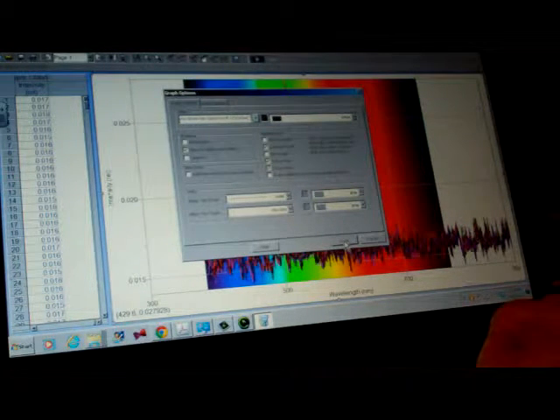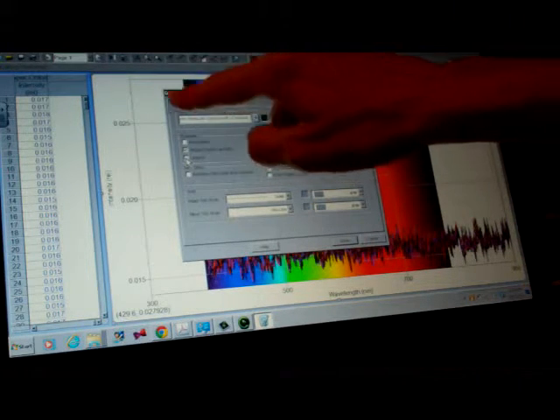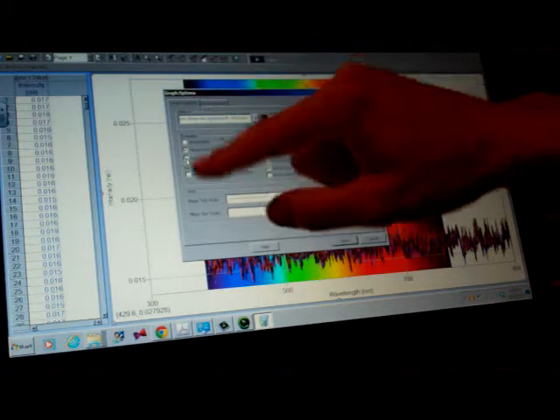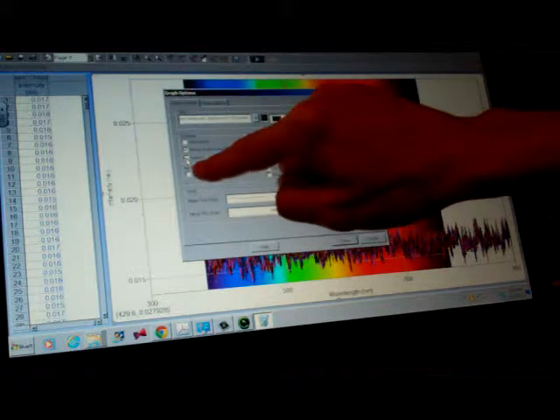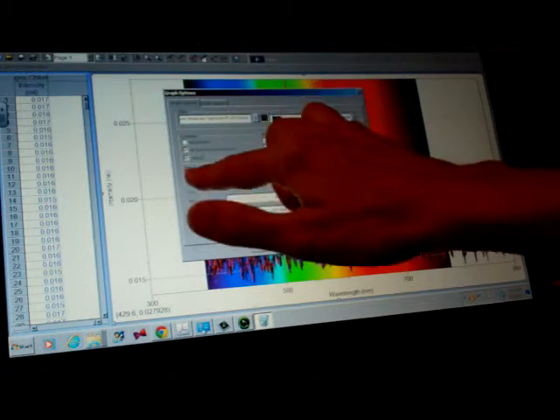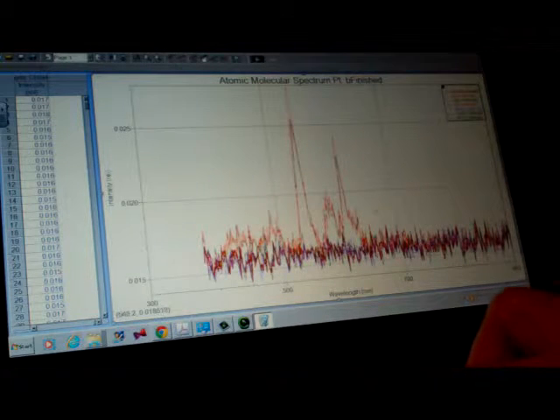And again, what else I would like you to do is, what I did was just double click on the graph near the title region to get the graph options up. Then please click on Legend. Underneath Examine, click on Legend and click Done. And again, that would give us the opportunity to see all of our various data here.